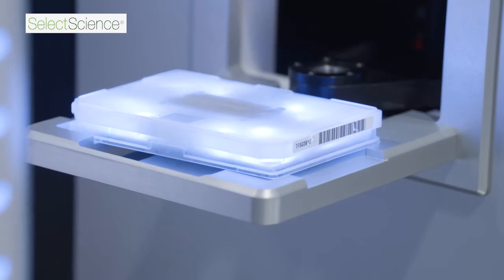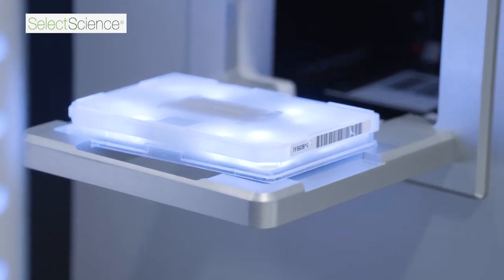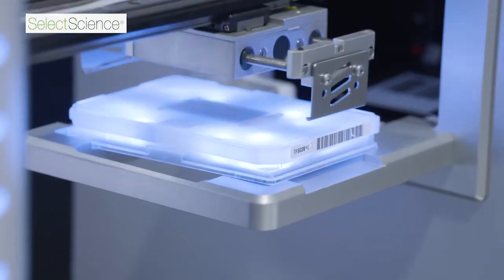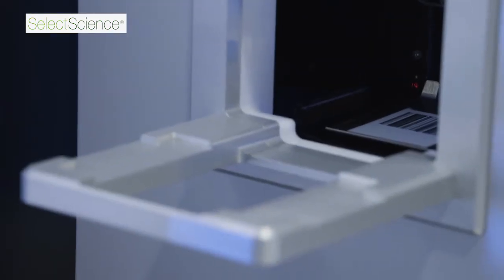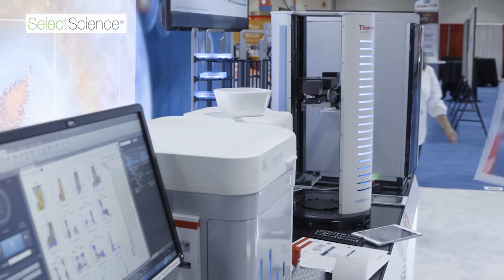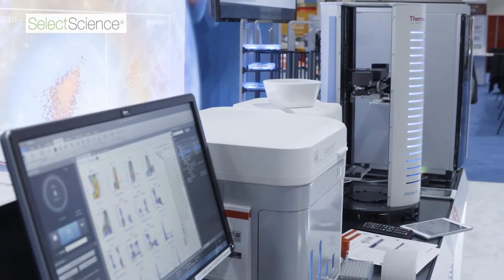Moving into the future, we hope to move our technology into the parts of the world that need it most. So moving towards microfluidics and deployment into the developing world, such as Africa, Asia, and the poorer parts of South America. We aim eventually to characterize a full suite of drugs and bacterial combinations that will allow us to move this into a clinical lab as soon as possible.